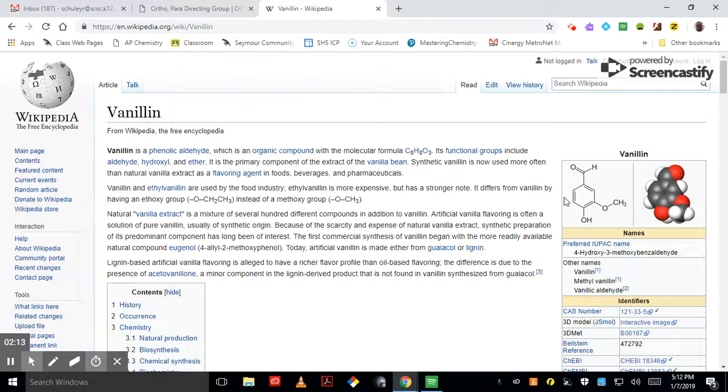So our goal is, by knowledge of information I'm going to give you, to try to predict, and it's going to turn out that all 3 of those compounds have a different melting point. So we're going to produce the compound, we're going to brominate, and there will be 1 bromine put on the ring, and it will go to one of those 3 positions. We're going to predict which one it should be, and then determine if we were correct in our prediction of where we thought it would go based upon the chemistry.